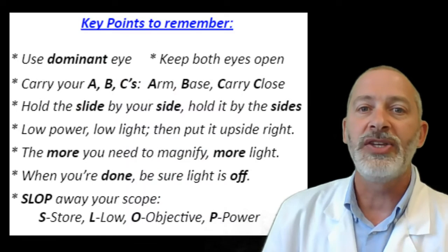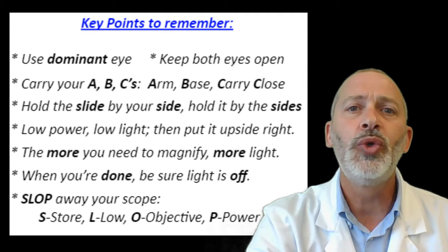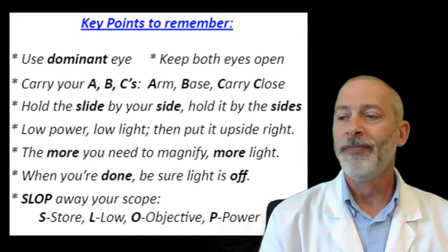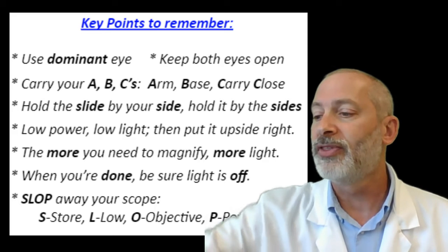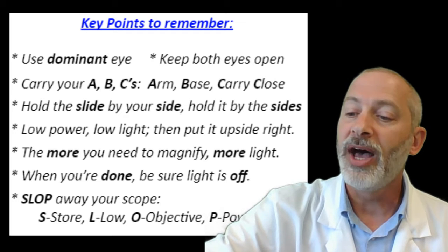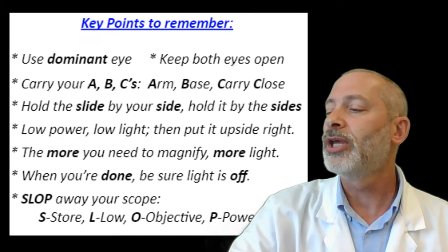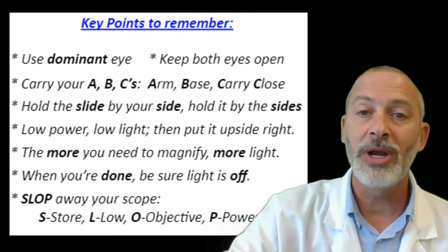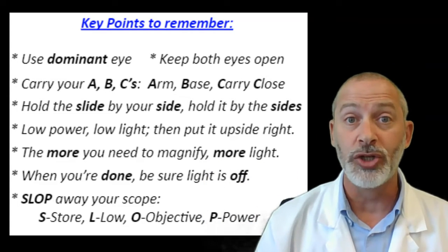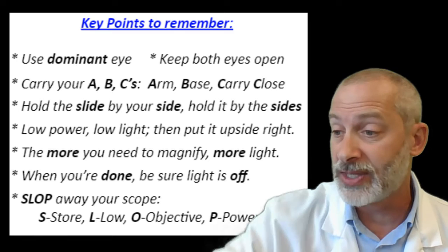We've got a whole list of things here we need to do, starting with some key points to remember. Now, you're going to have some time. Actually, I don't even think you have to write these down, because if you are observant, I believe I have already written these down for you in your book on page 31. I'd like you to feel free to add some notes to that page if you'd like, but really pay attention to how we're going to be determining these things.